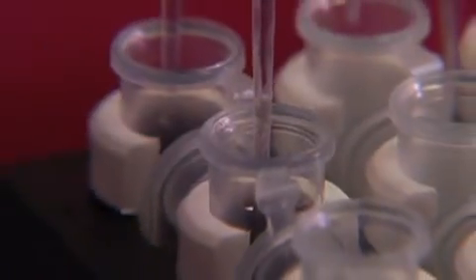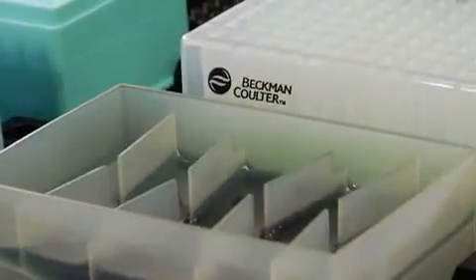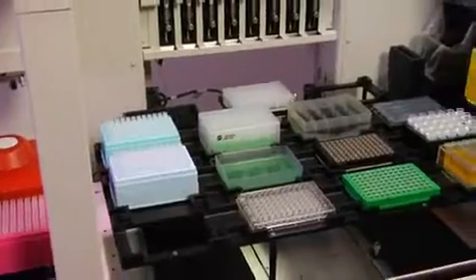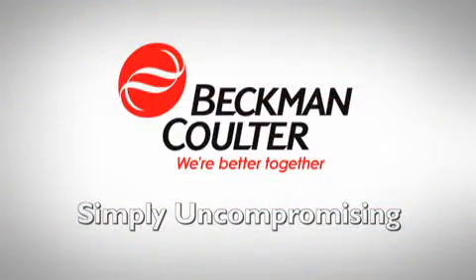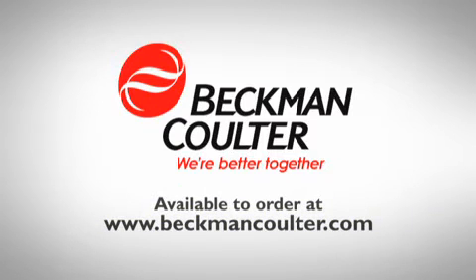Beckman Coulter Biomek Pipette Tips, the only tips that are designed, validated, and approved for use on Biomek liquid handlers, delivered directly to you, simply uncompromising. Available to order at BeckmanCoulter.com.